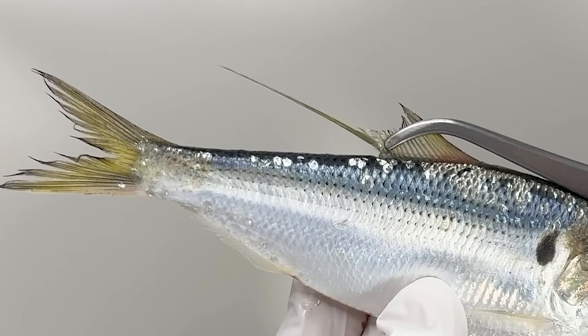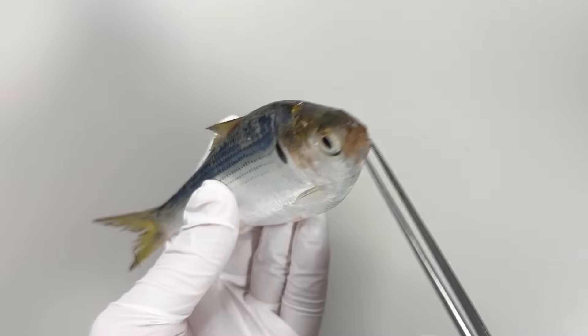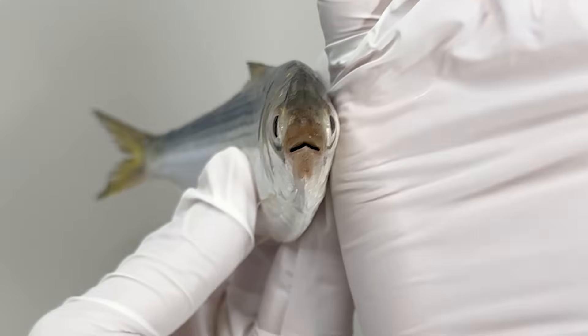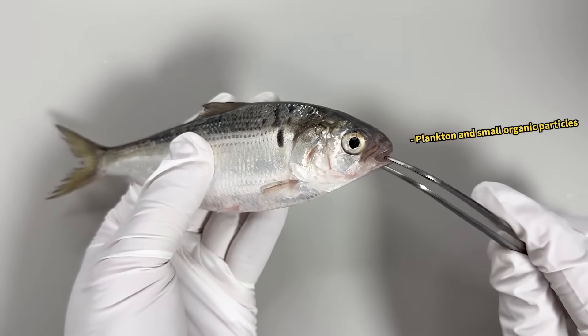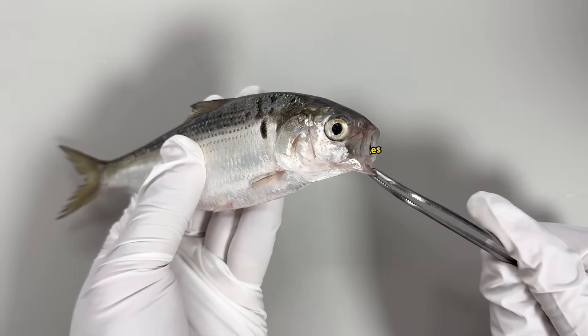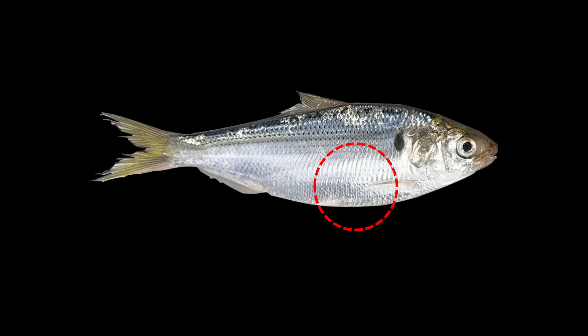The Gizzard Shad is characterized by its long, soft-rayed dorsal fin. These extended rays help the Gizzard Shad maintain balance and swim efficiently. The Gizzard Shad's mouth forms an inverted V shape. This trait is common in smaller fish species and aids the Gizzard Shad in capturing small prey floating in the water. Interesting, isn't it? The Gizzard Shad has an unusual organ within its internal organs that isn't found in other fish.